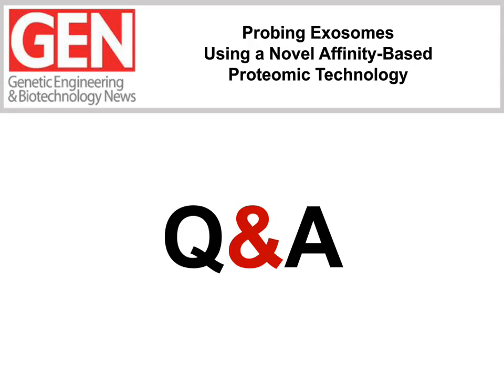But I think those are the two ways that you would look at cells: either using the named reagents where you already know what they're measuring, or selecting against the cell, but not knowing, or having to do some more work to find out what it is those reagents you've found are actually binding to. Thank you. Thank you, Steve.